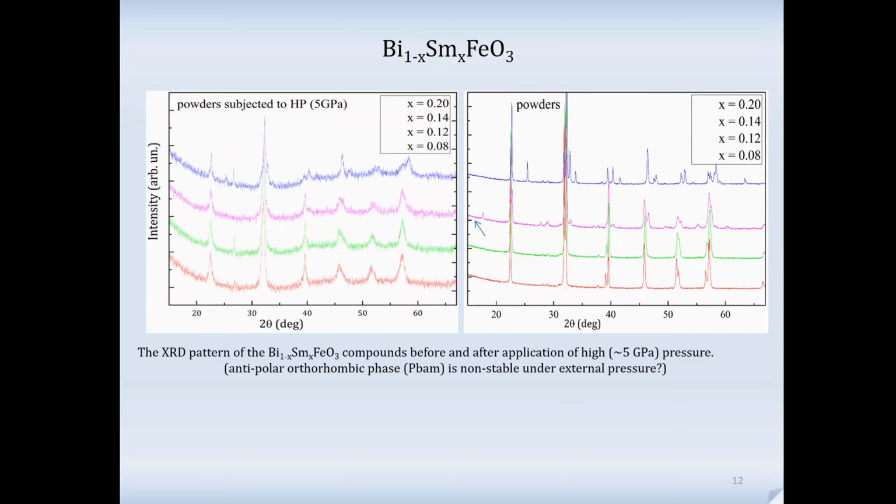Okay. Question is clear? I'll try to answer. Speaking about the probably preferred orientation of the crystallites, which can happen under high pressure, I'm pretty sure we still have random. We can induce some preferred orientation, but I'm pretty sure that in general we have random orientation of the crystallites.